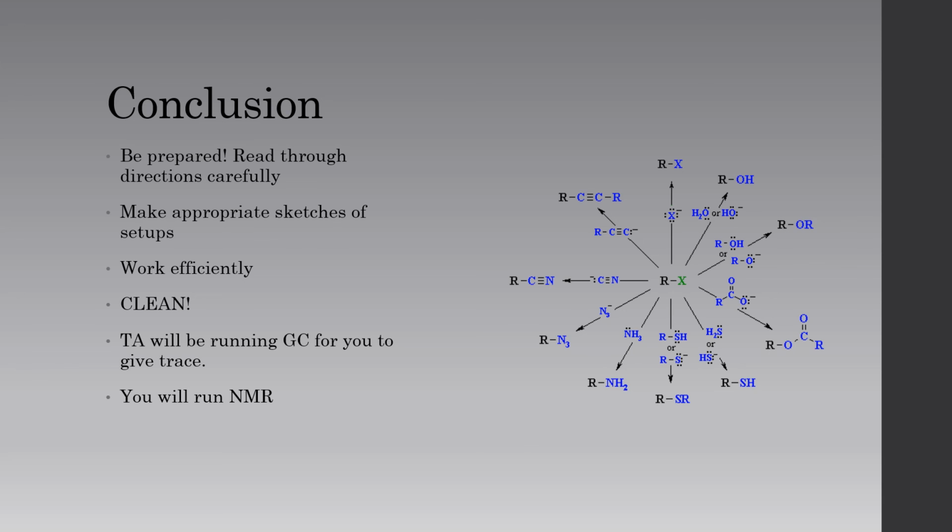So in conclusion, for this experiment, you have to be prepared. Thoroughly read these directions. There's a lot of very specific instructions. There's some that are time-based, and so we have to know what we're doing before you come in here. Otherwise, you might spend too much time. It's going to throw off your results.